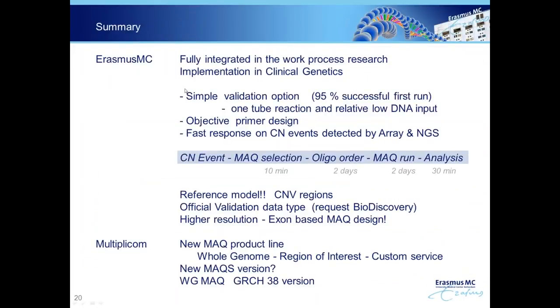So to summarize, I think we showed that we have fully integrated the MAQ assay in the work process. The implementation in clinical genetics is underway. It is a simple validation option. I think 95% is successful in the first run. As mentioned, it is a one-tube reaction, with relatively low DNA input, I think 10 nanograms. It has objective primer design, we don't have to worry about our designs.